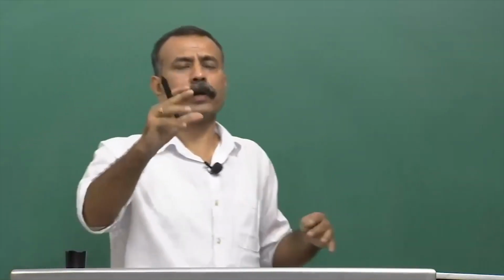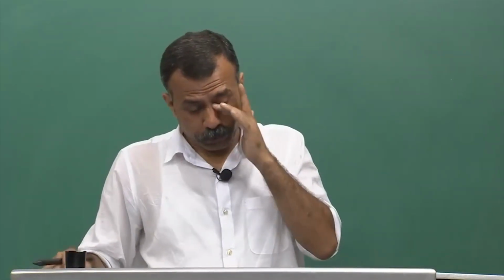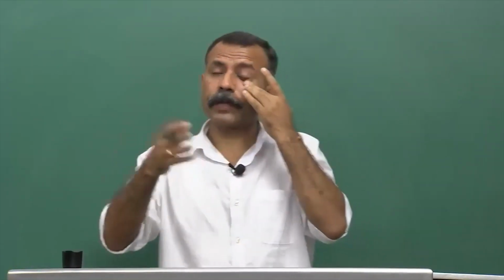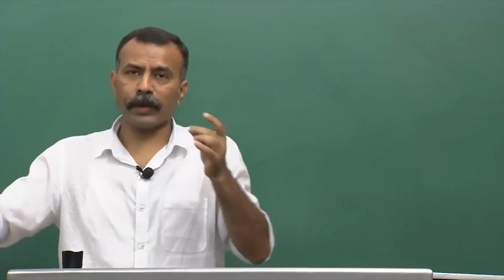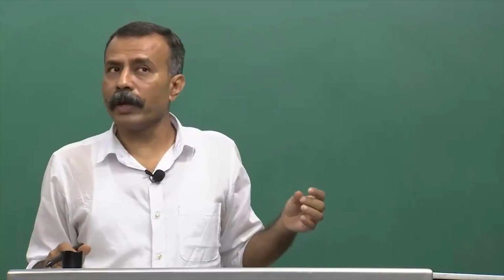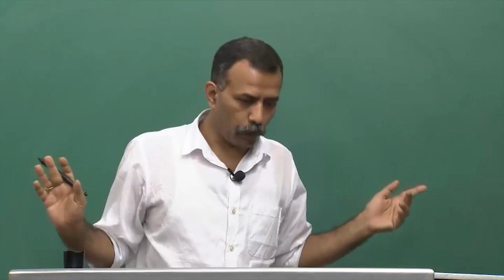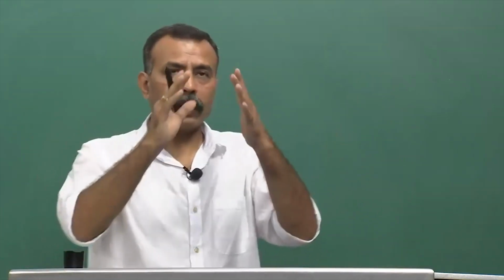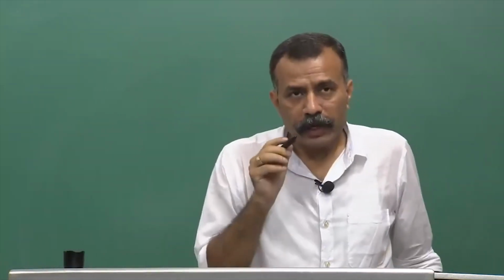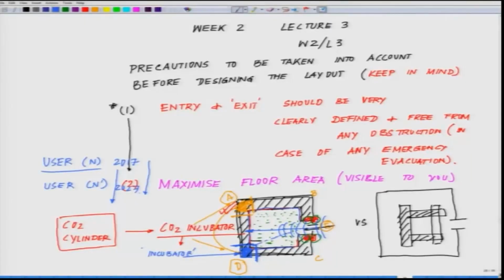Every lab should have some restricted numbers, which has its own drawbacks though. But one can always rotate, this month you have these designated people, the next month others. It's maybe a wise idea, but if you can really manage the trained individuals, if you can train them right, no problem. So I will leave it up to the user. How many designated users? So by say 2017 to 2027, the next 10 years, how many users will be there?